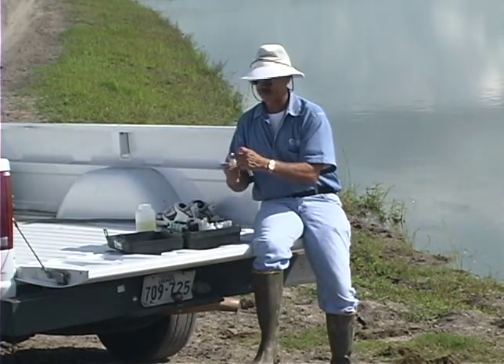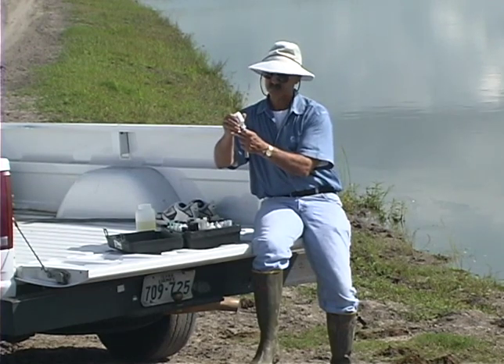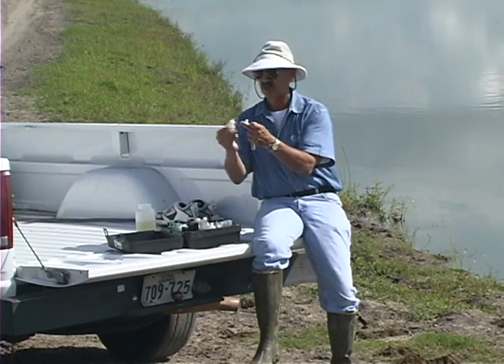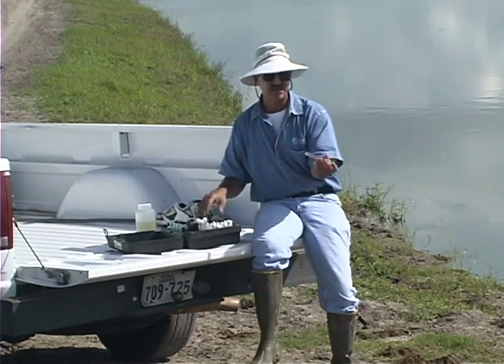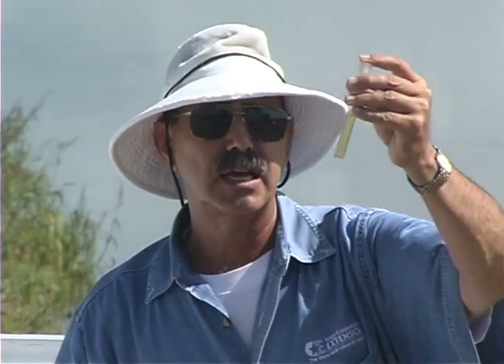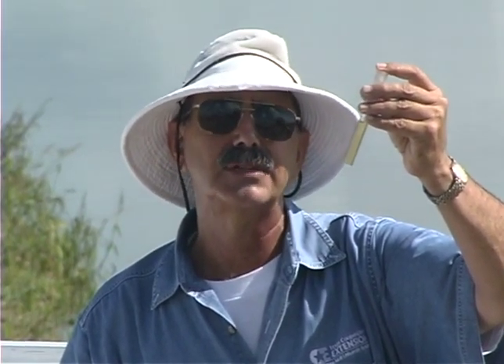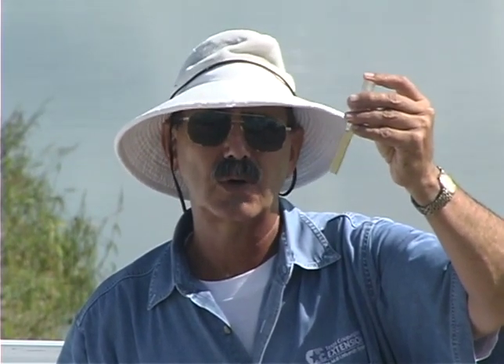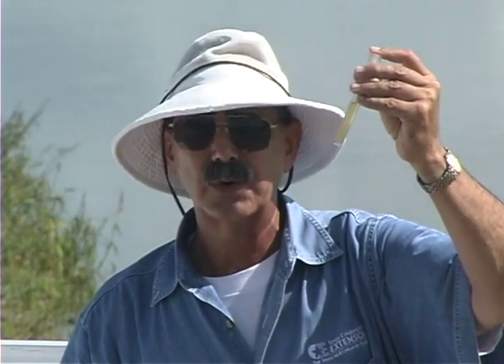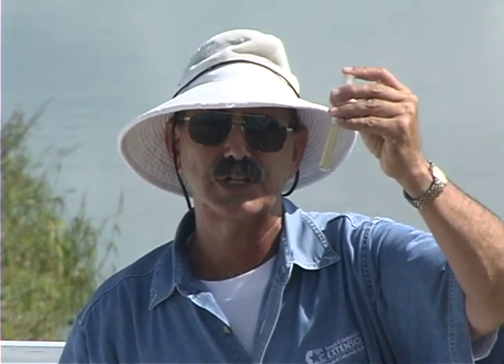Now we're ready to add the second reagent. We add 12 drops. What we're looking for in this test is a color change to yellow if ammonia is present. As you can see, we got a color change on our sample after we added the second reagent, indicating we've got a high level of total ammonia nitrogen. Ammonia can be very toxic to fish under certain other water quality conditions, so we're going to suspect this as being at least part of our problem with this fish kill.